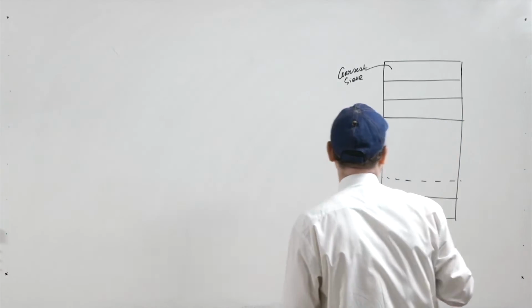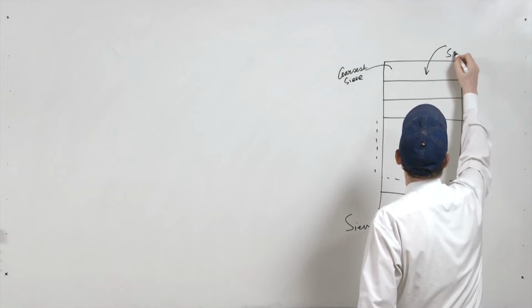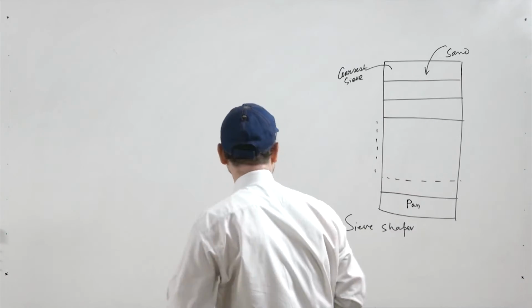Now, what we do is we keep the sand in this, and then this unit is vibrated for some amount of time, say 15 minutes.